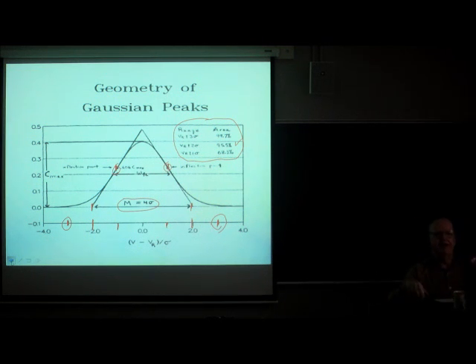That is obviously slightly below the inflection points, because the inflection points are at 0.606, whereas the peak width is at 1/2, which is more like there.